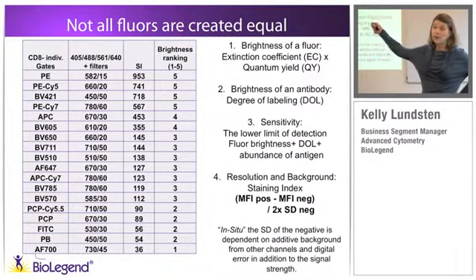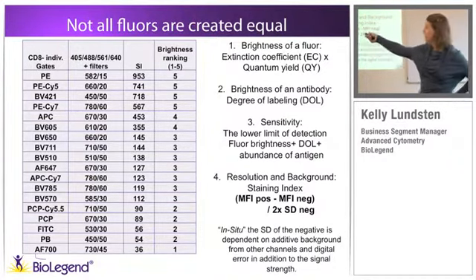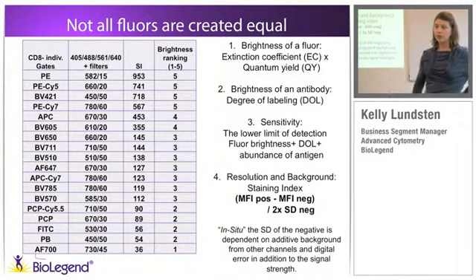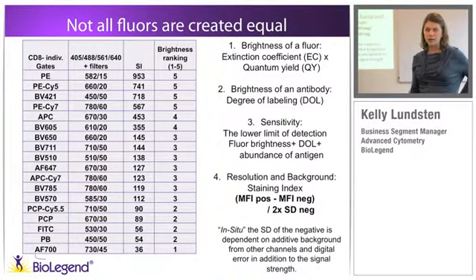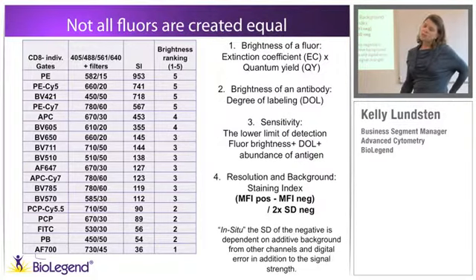However, if we had been using a 488 laser to do that excitation, that would drop the emission by about 40%. And that would all of a sudden make BV421 the brightest fluorophore. So that's why you can find that these could be quite variable between manufacturers, because it is very much dependent on how they derive the data. And this is only a tool. This is absolutely never a list of favorites.